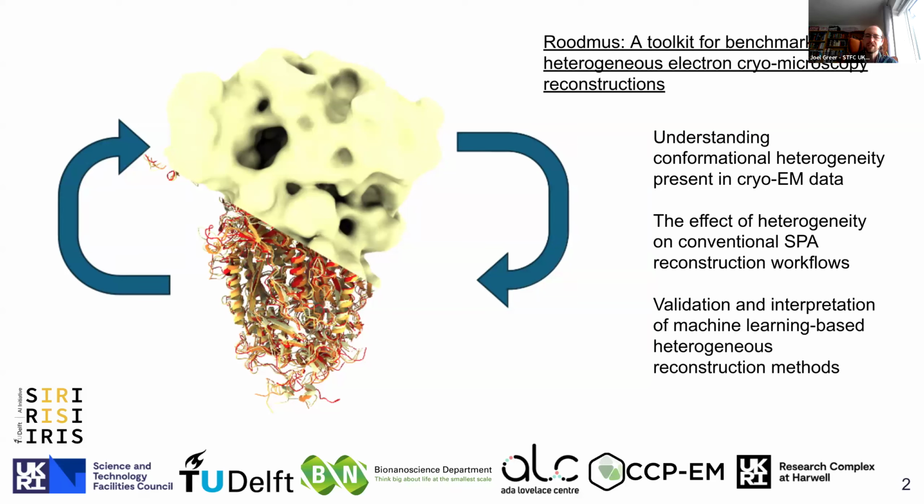These specialist methods, which we term heterogeneous reconstruction algorithms, or HRAs, can be difficult to interpret and validate. So it's desirable to be able to investigate their performance using ground truth information.